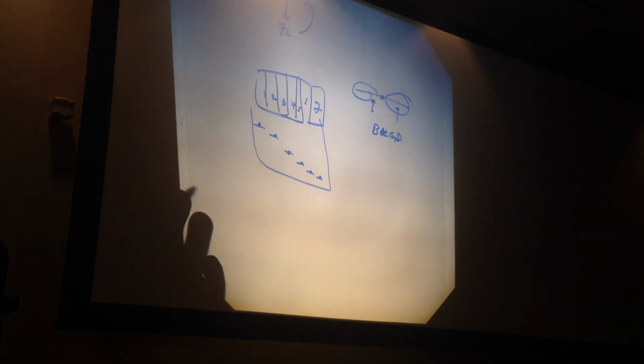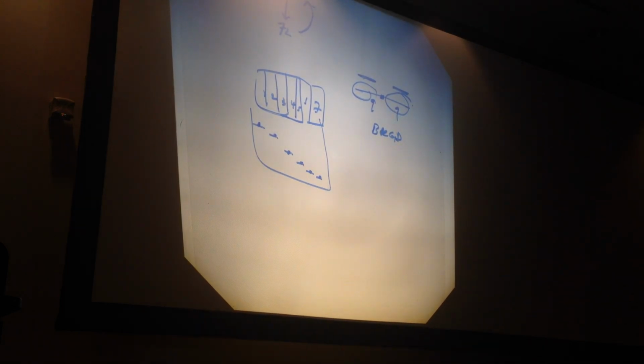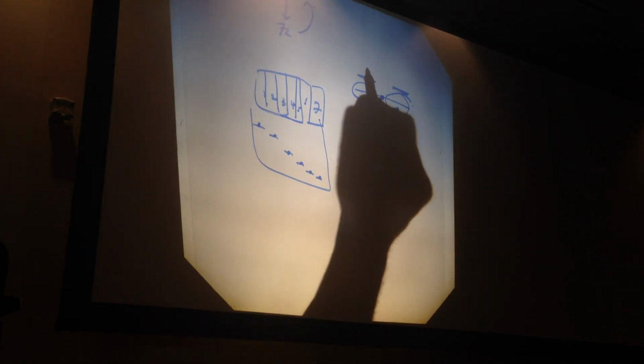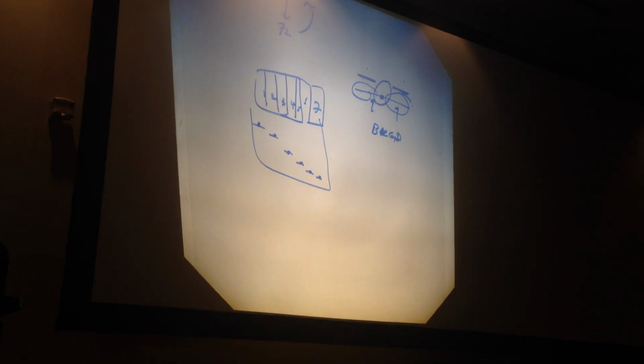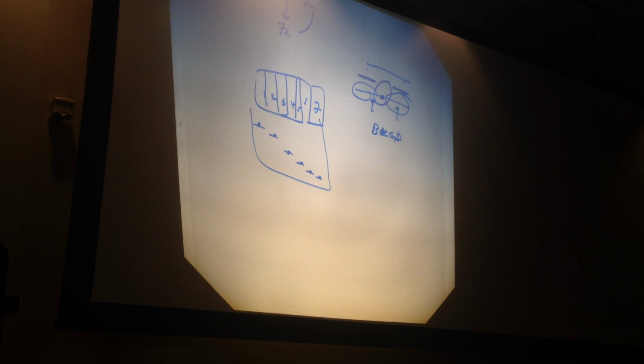So here we can see if all of it binds perfectly fine, or if most of them bind, but for some strange reason 3 doesn't bind, or half of 3 doesn't bind. For example, you could have binding here and here, which might look like it detects signal. You could get some amplification, but because you're missing this one nucleotide, you're going to have a lot less binding efficiency than if you were to bind all 18 in a row. And it will measure that as background. So this is just giving us false positives. So this measures the rate of false positives.